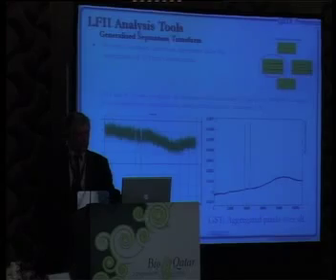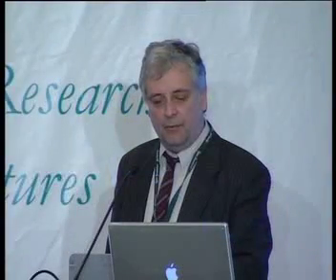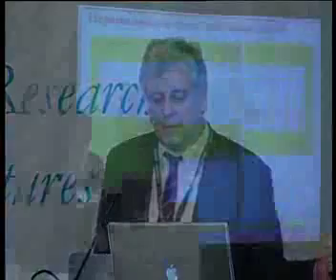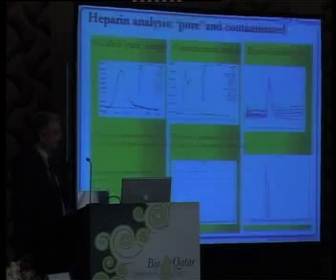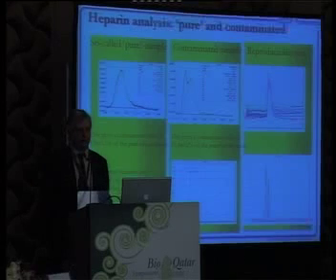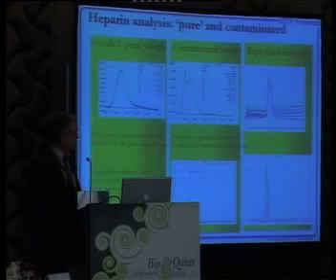That looks a bit like a mass spec trace. I also want to show you work we're doing with the FDA. I won't bore you with details of the algorithms, but suffice to say we have 2 ways of looking at analytes. The FDA sent us some heparin. Heparin is an anticoagulant, and unfortunately it's been contaminated by the vendor. I think it's probably pig intestines in the vendor source.